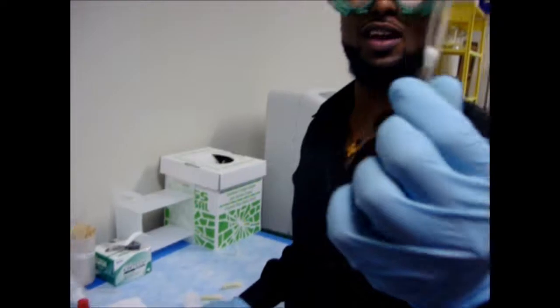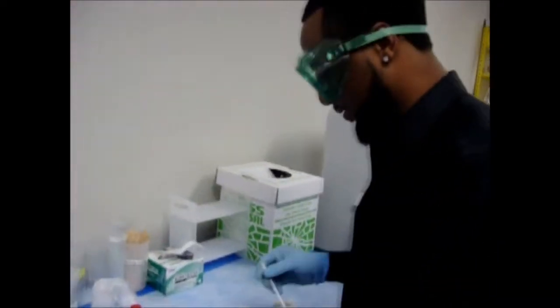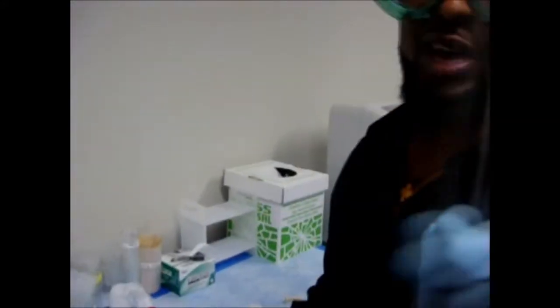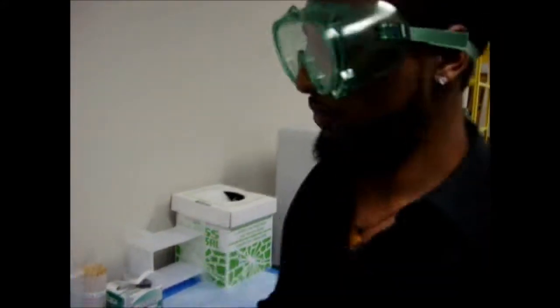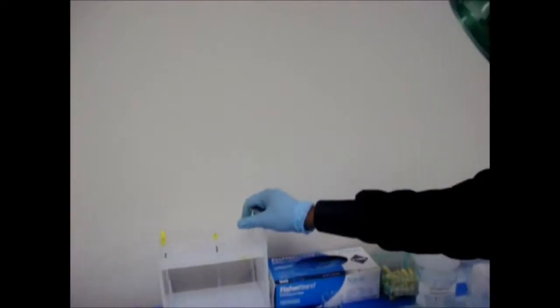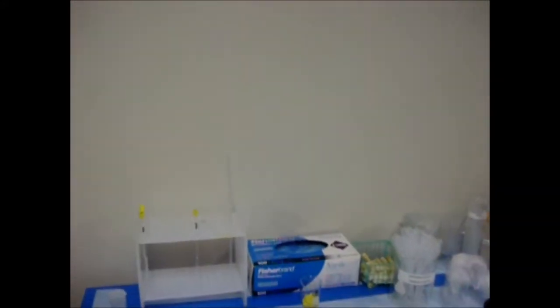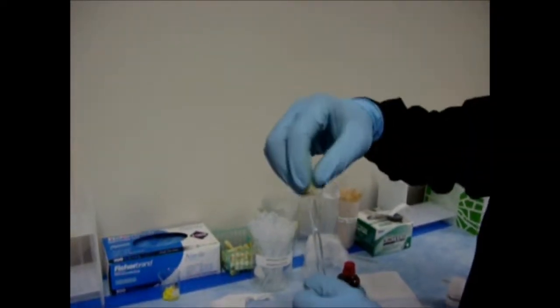Alright, that's how we have it right here. That's after we packed it down, correct? Yes, sir. You can see right here, the wool is right there. We're going to use it as some type of filtration device. And this is the tube that we're actually going to put into the NMR machine. So we'll put that in right here. Next is to get the liquid.